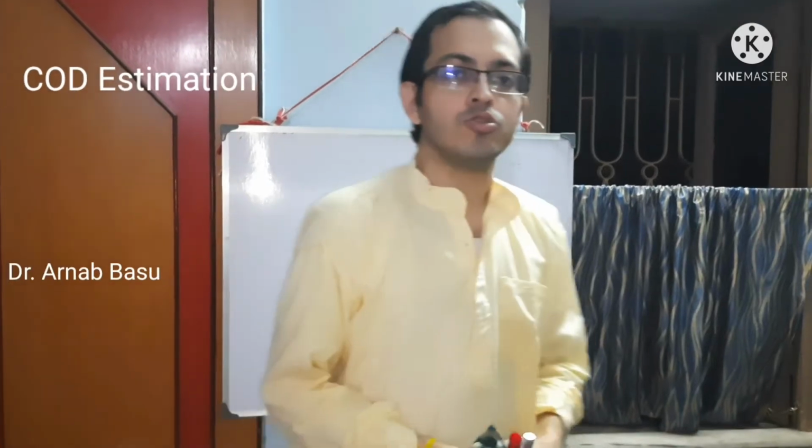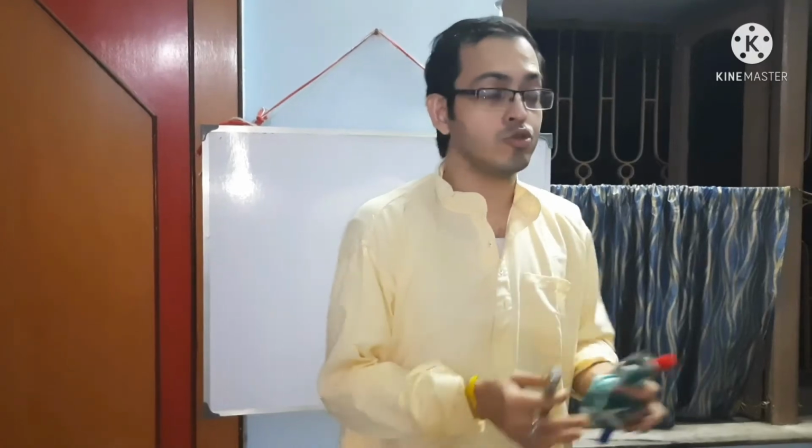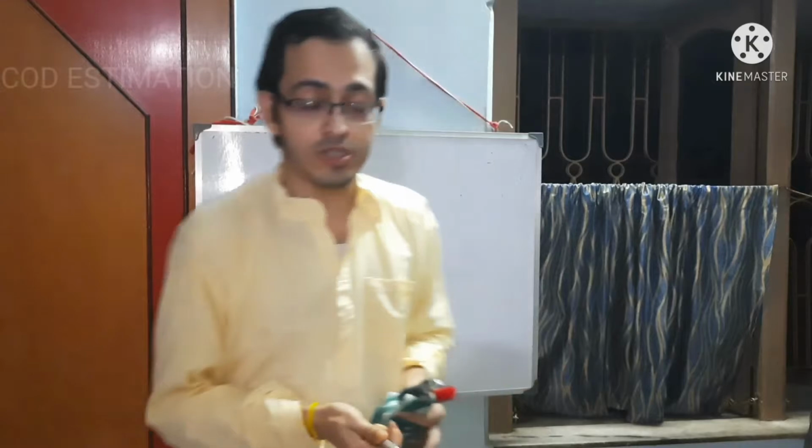Students, today we will discuss one practical topic of our syllabus, that is how to estimate the COD. So what is COD?